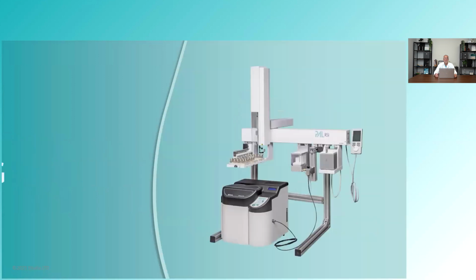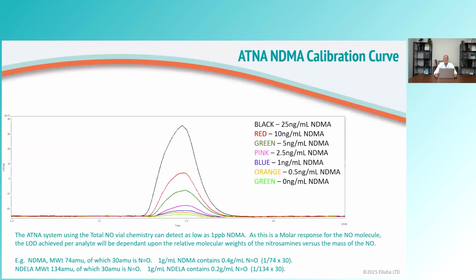The ATNA system is sensitive. We're able to detect 1 ppb of NDMA. And as I said earlier, the TEA is a molar detector for the NO molecule liberated. Thus, the sensitivity of 1 ppb of NDMA would equate to 2 ppb of NDELA, as given in the summary at the bottom. This is simply because the relative molecular mass of the NO compared with the rest of the NDELA molecule is about half that of NDMA.